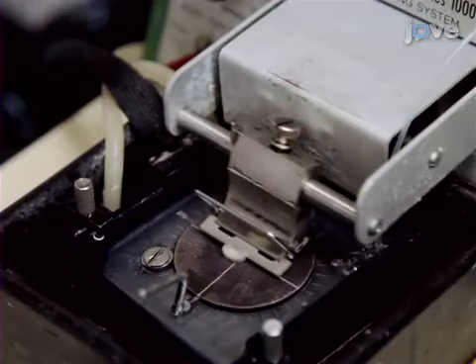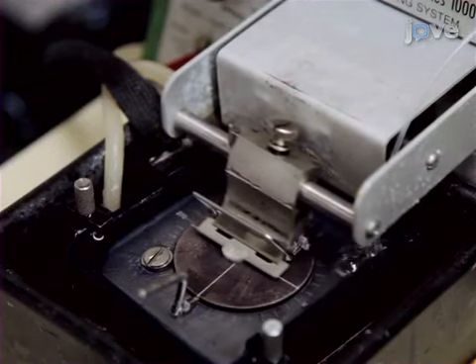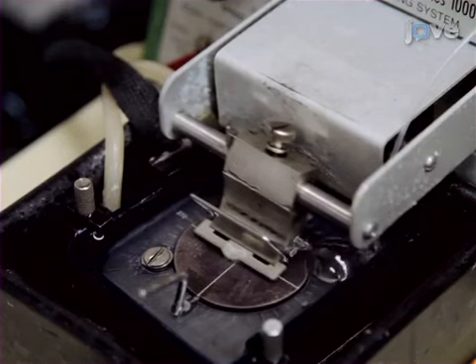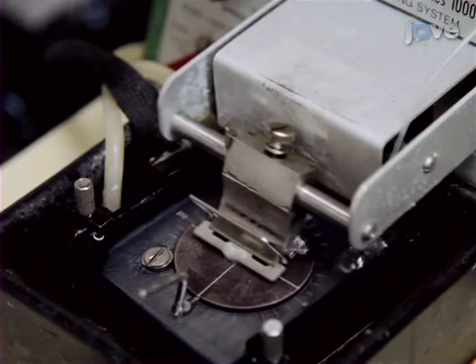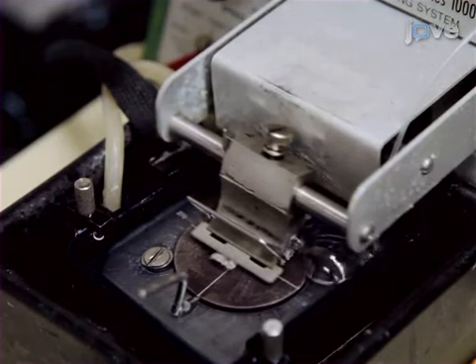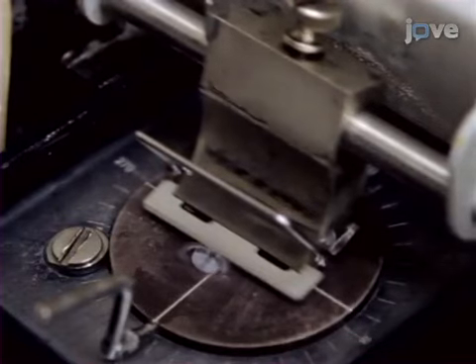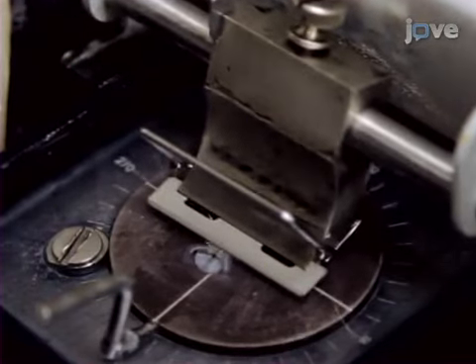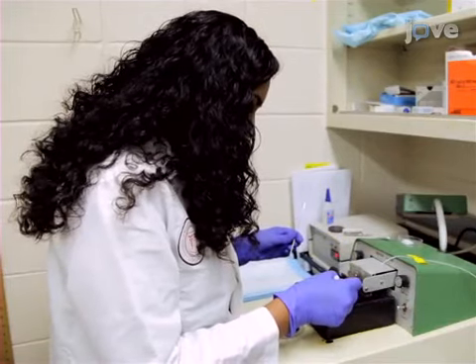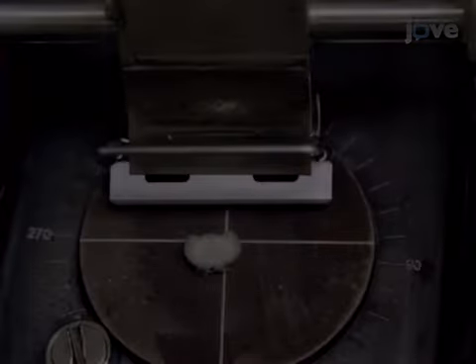Begin this procedure by placing the dissected brain on the chuck in the vibratome chamber, with the vibratome set to slow speed at level 2 and high amplitude at level 9. Cut slices at 300 to 500 microns until reaching the hypothalamic area, then cut thin slices at 100 microns from the posterior to the anterior to isolate the precise VMH region. Pay close attention to anatomical changes at bregma minus 2.0.